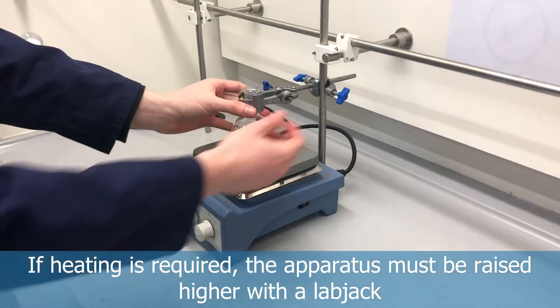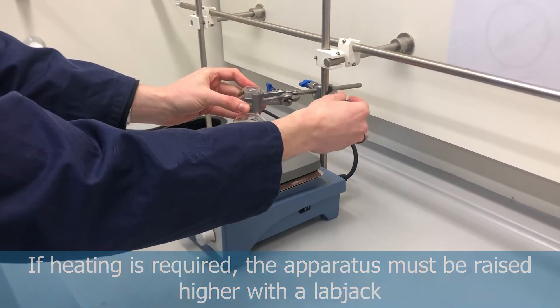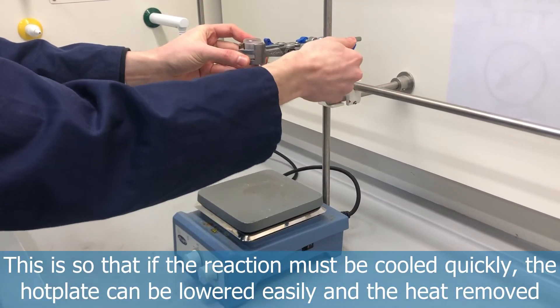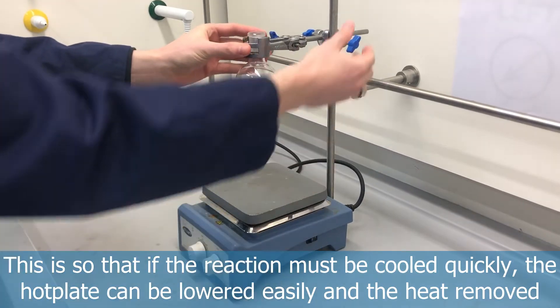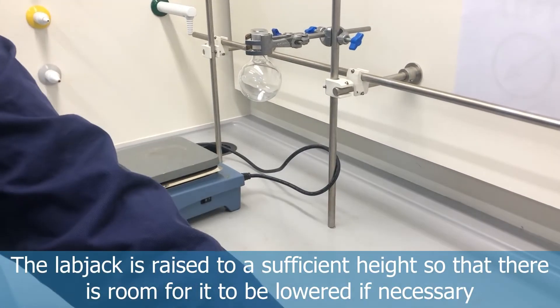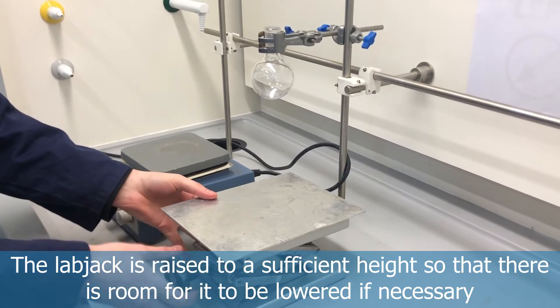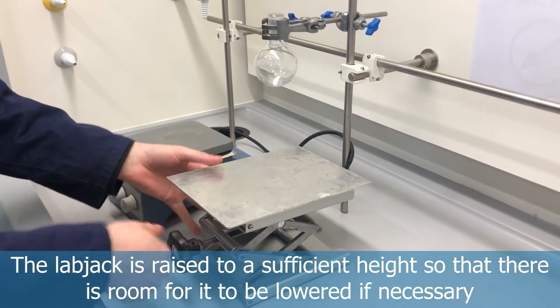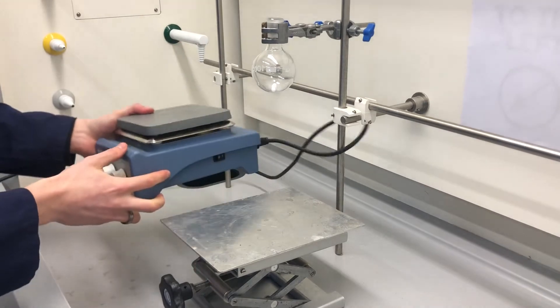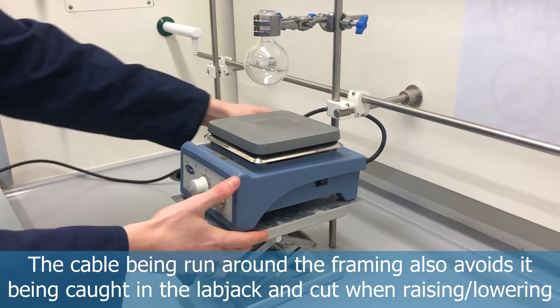If you wish to heat your stirring reaction, you'll need to raise your apparatus up with a lab jack. This allows you to lower it very easily in an event where the heater needs to be removed immediately — for example, if the reaction is going out of control. Select a high point on the framing and raise the lab jack first without the hot plate on it, as it can be a bit heavy. Then at a decent height, place the stirrer hot plate onto the lab jack, leaving a little room so you can easily raise and lower it.